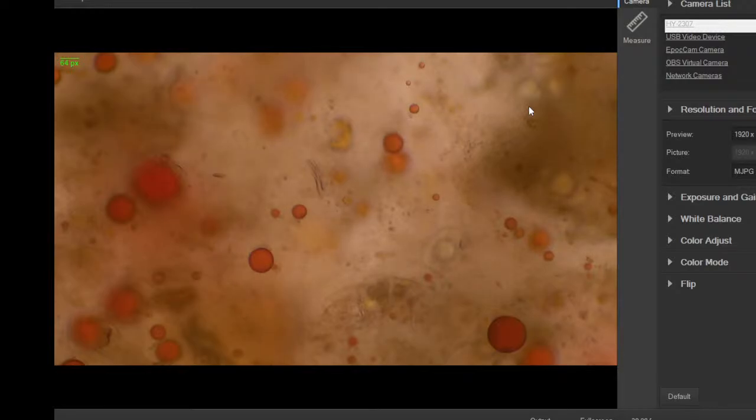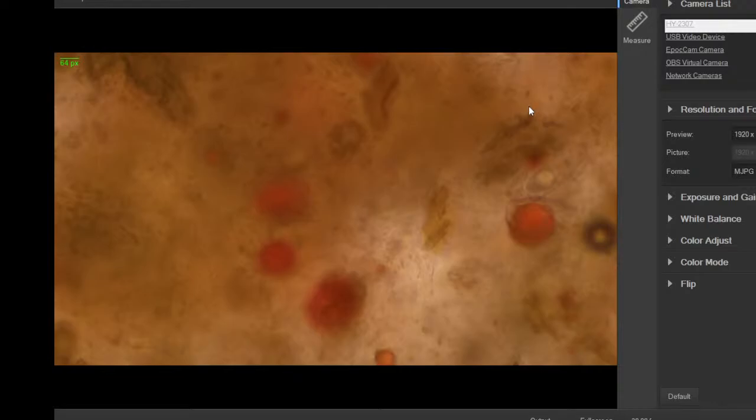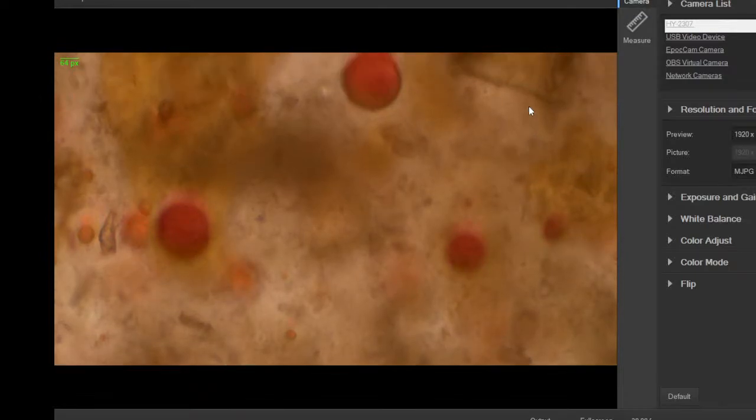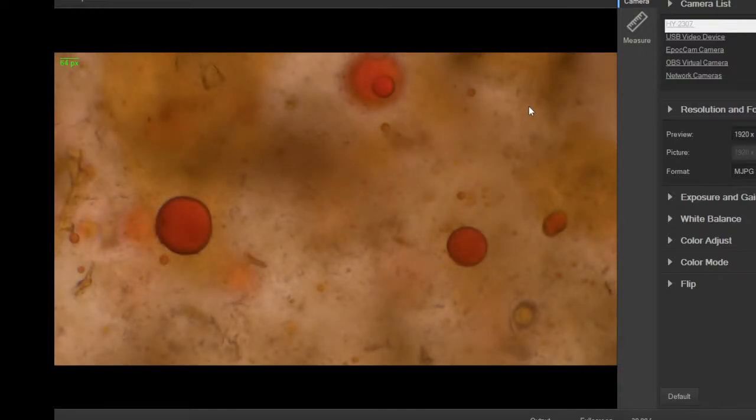Let's cruise around, find some other spots that are interesting. That color really pops. It's pretty cool. If you darken this up a bit, it looks almost like some really cool space art. Little planetary shapes and moons and such.